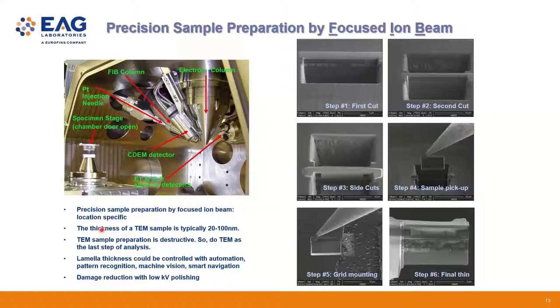In our lab, we prepare samples from ceramics all the time. Some of the engineering problems really use sapphire, or even silicon carbide, which is highly insulating. So you can prepare the sample with FIB these days. Typically that is not a big problem. But of course, there's a certain limit. If you cut organic samples or insulating samples, you always want to be very careful. And again, this is very specific. If you have specific problems, you can probably reach us.